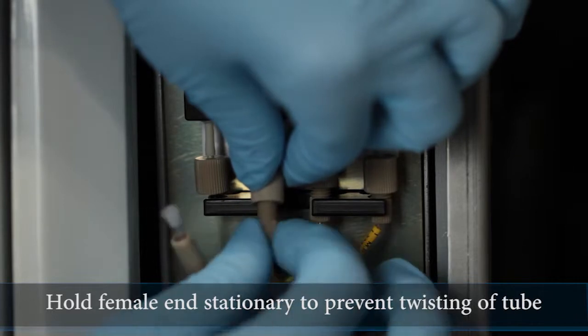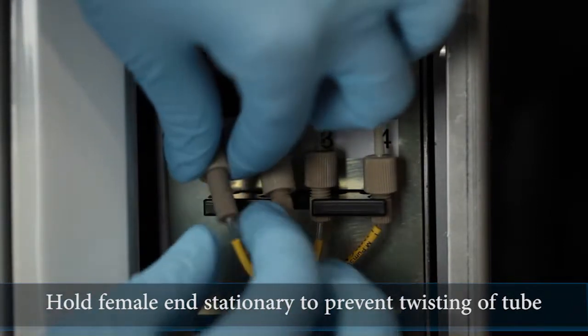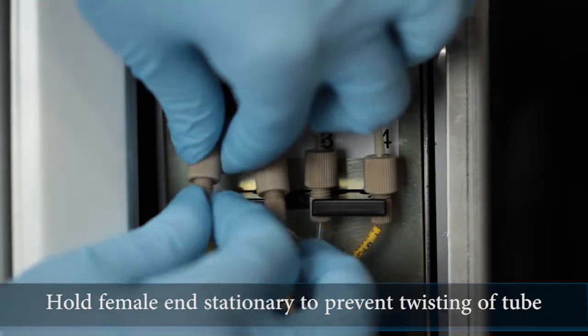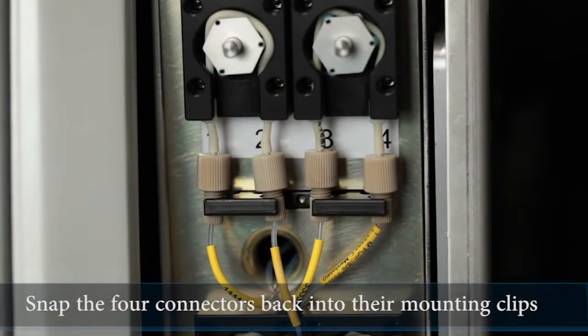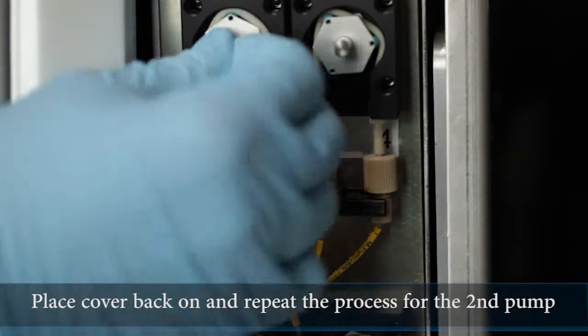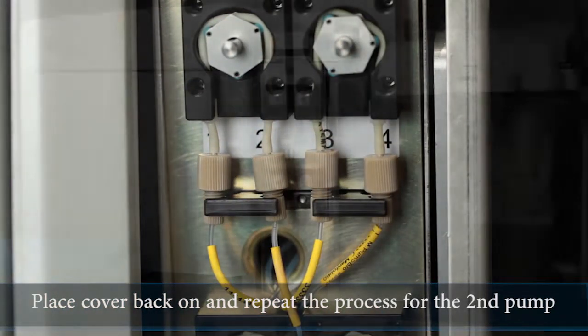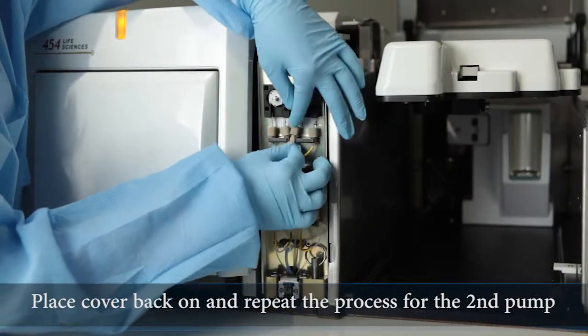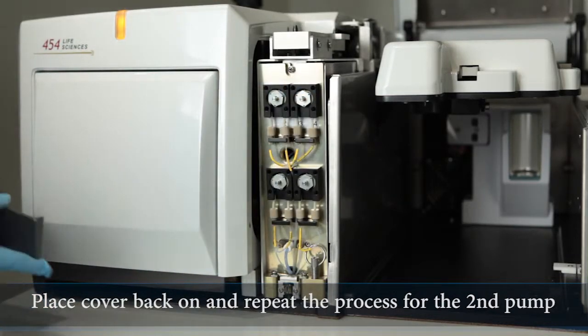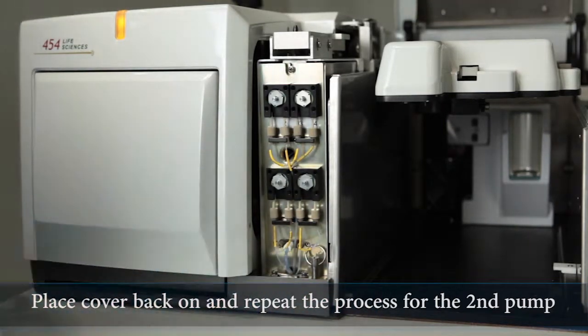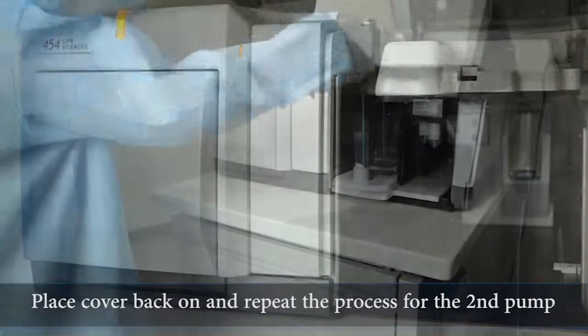When screwing together the male and female tubing ends, holding the female end stationary while turning the male connector end will prevent twisting of the tubing inside the pump housing, which would likely cause reduced pump performance and could increase chances of tube failure. Snap the four connectors back into the mounting clips, place the cover back on, and repeat the process for the second pump.